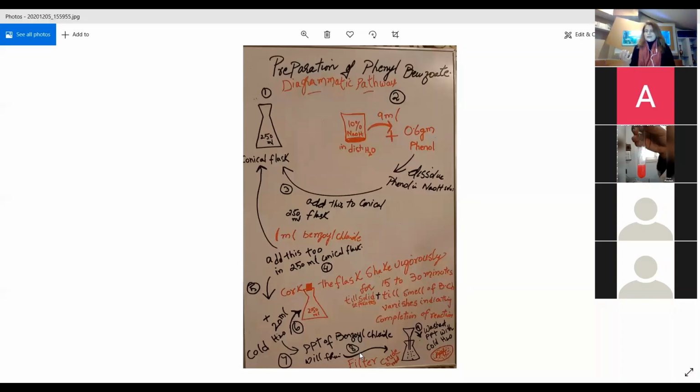You have successfully prepared your compound, but now it's in the crude form, that is, the raw form. That means it needs to be purified, and for purification, of course, we will adopt the process of recrystallization. In your scheme, they have said to recrystallize the crude product from spirit, that is, you can use ethanol to easily recrystallize this compound.